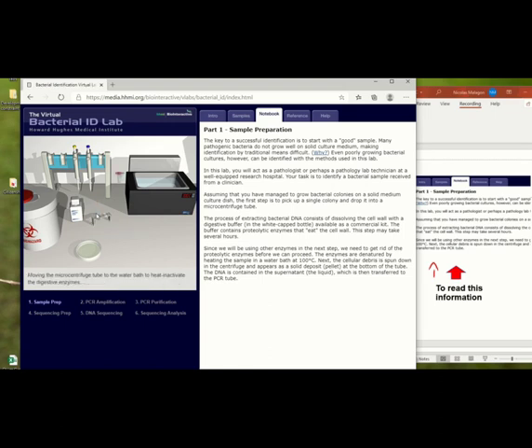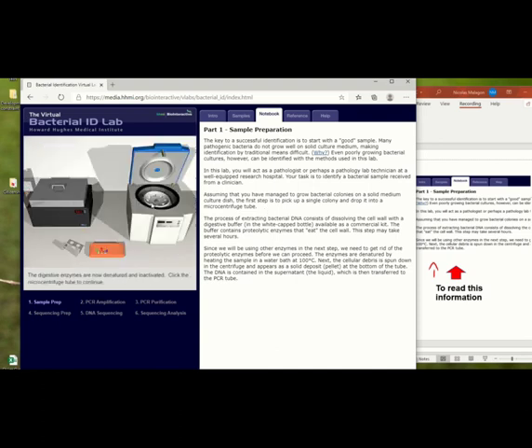So we click here. It moved to this place, and I can tell you more about what is happening here. Then click on this tube. Click on the centrifuge lid to continue.